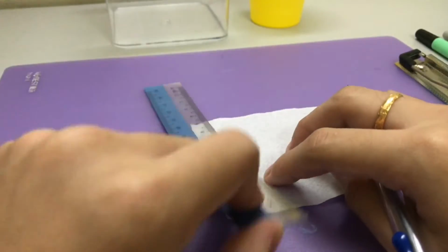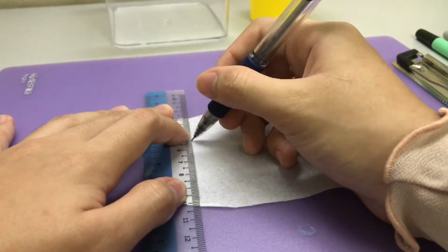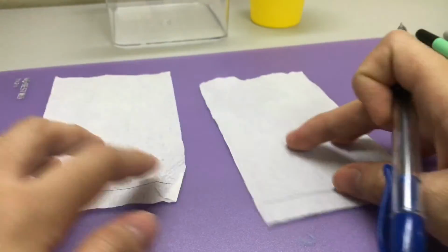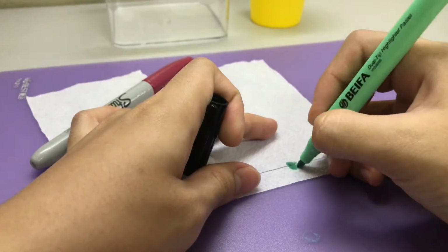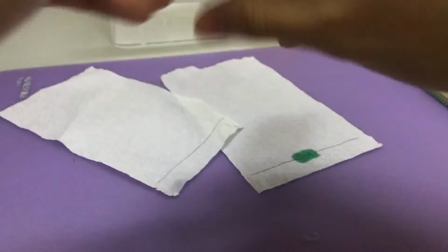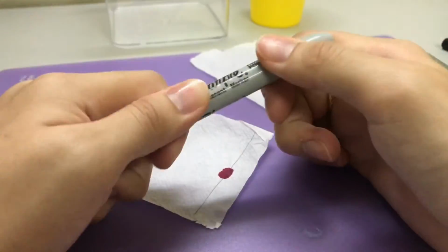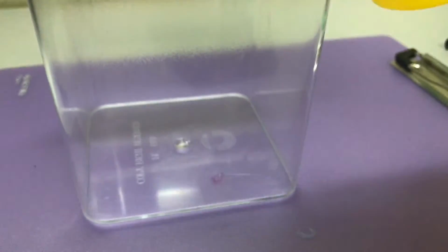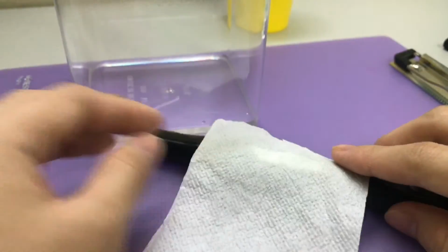Firstly, we prepare a few pieces of tissue paper and draw a straight line on it. This straight line is because we're going to spot the marker onto the straight line. Okay, so for this experiment, I'm going to use the green colored highlighter and maroon colored Sharpie. A few color pigment mixtures are placed on the tissue paper and the container is filled with water.